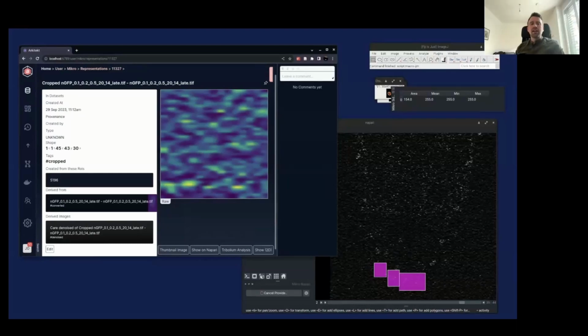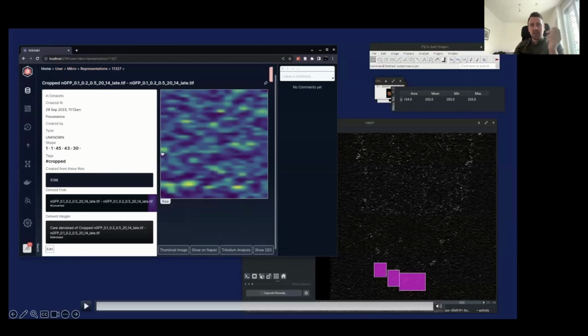Exactly. So that's perfectly fine. All of these apps can be completely interactive. You could write a node that says load it into ImageJ, and then the user does some manipulation, and then you send it further, like adjusting contrast, for example. It goes a little bit against the principle of what I would like to establish with this, because the data is managed by Arkitekt.